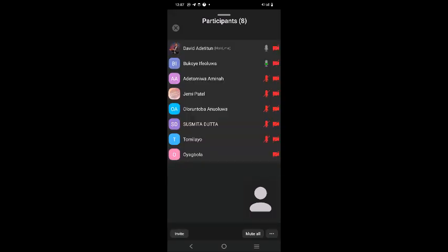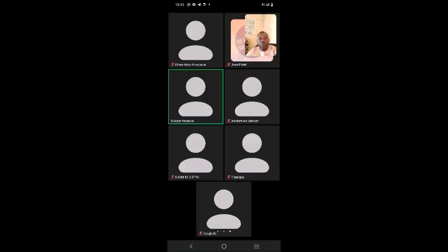Okay, I have a question, ma. My question is, you put a material in the autoclave. When you are removing it, how do you know if it has been autoclaved or not? Because the autoclave is supposed to sterilize it. How do we know if it is sterile or not?